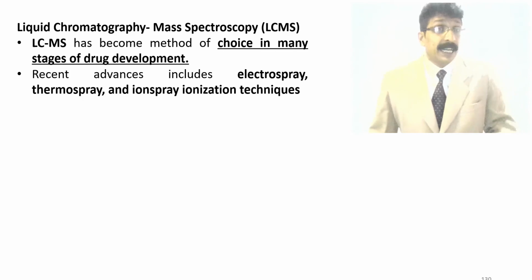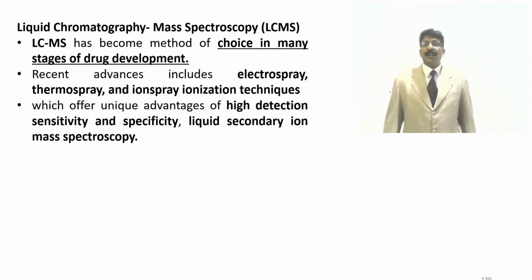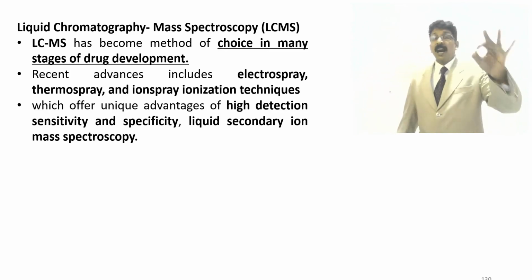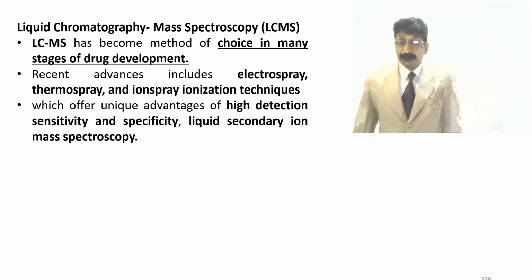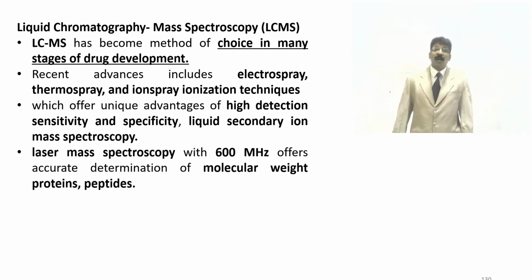Liquid chromatography connected with mass spectroscopy offers unique advantages of high detection sensitivity and specificity.